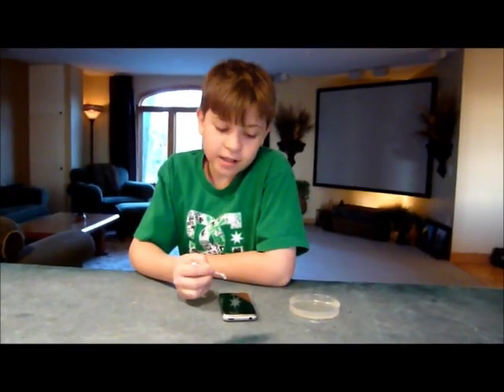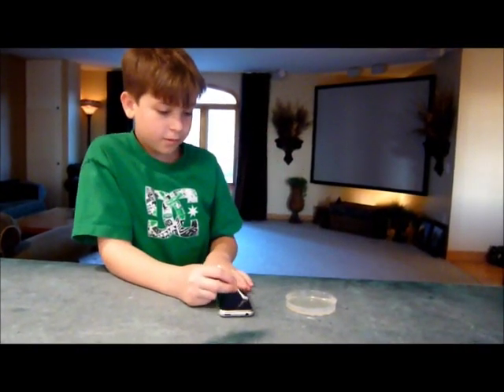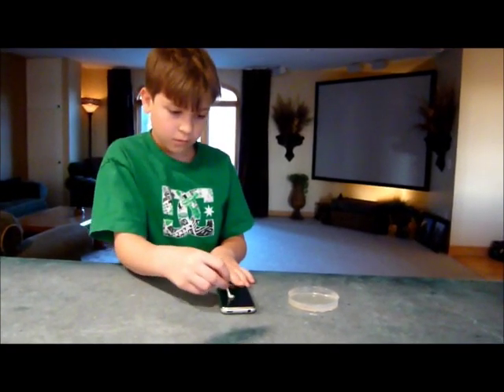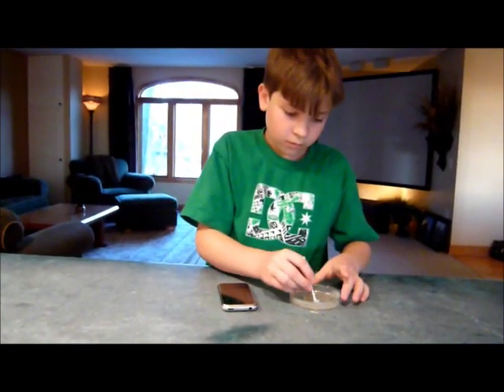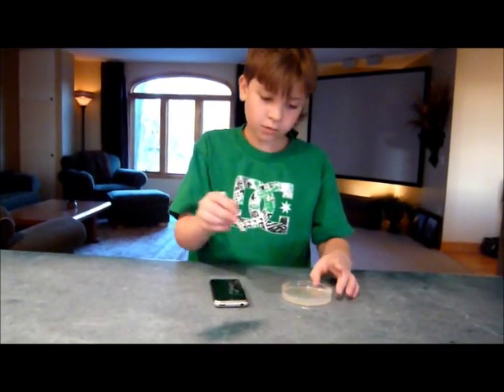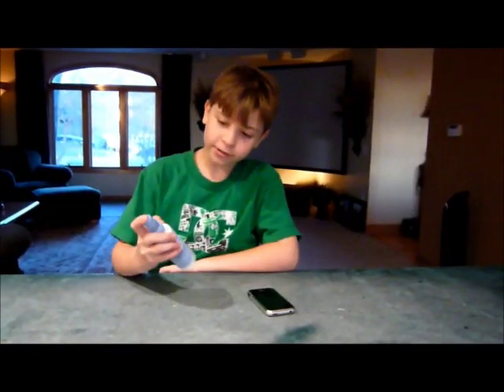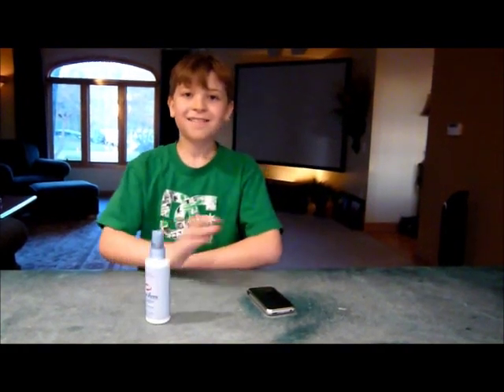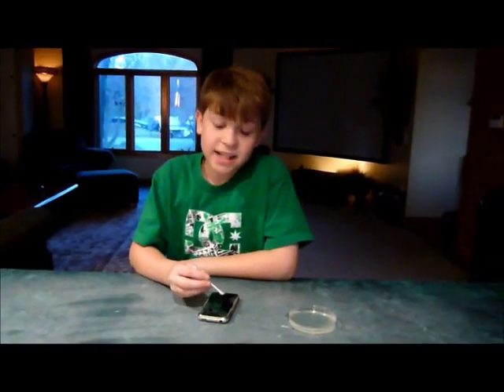Now let's test the cell phone. Now let's clean the phone. Now let's test it again.